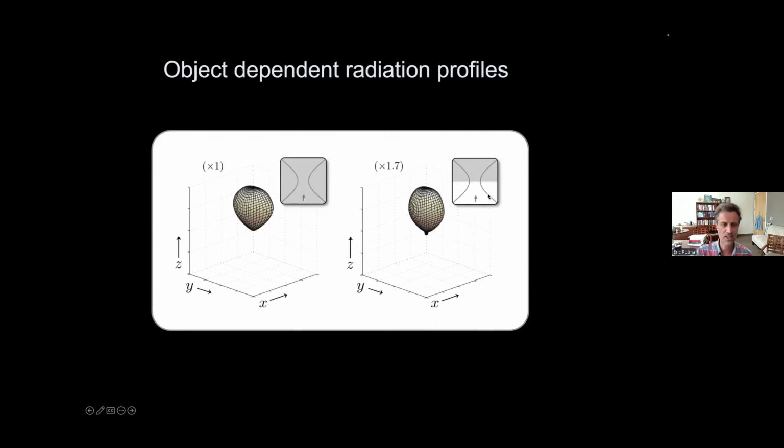Okay, now what if I just fill up the entire focus with molecules that produce a coherent signal? Then, interestingly, my peanut shape disappears, and I get nothing in this backward direction. Okay, so this is basically for negative angles. This is the backward direction. Everything is going to go up. That is because all those oscillators produce photons that only constructively interfere in the forward direction, and therefore radiation is very strong in the forward direction, but destructive interference is prominent in the backward direction.